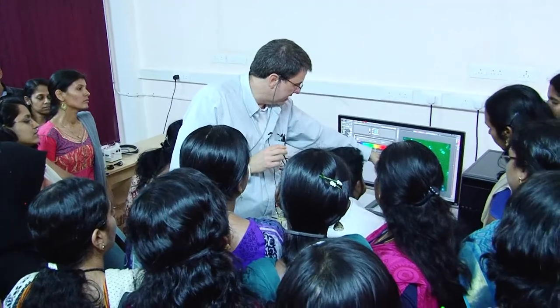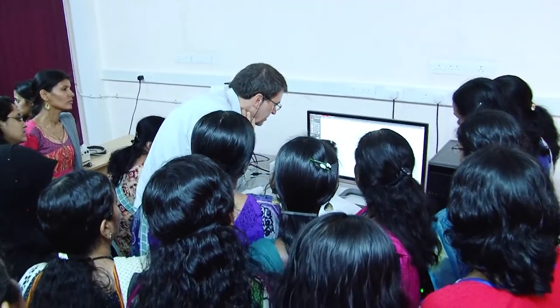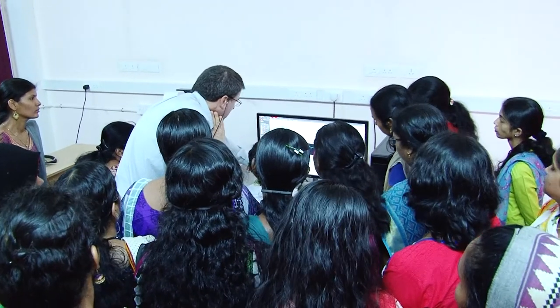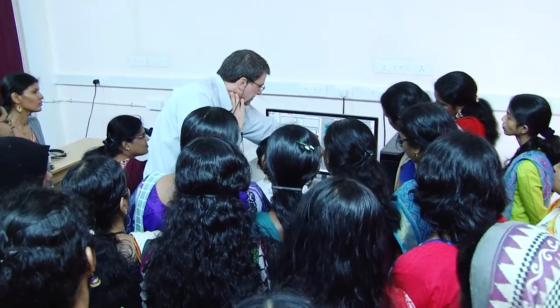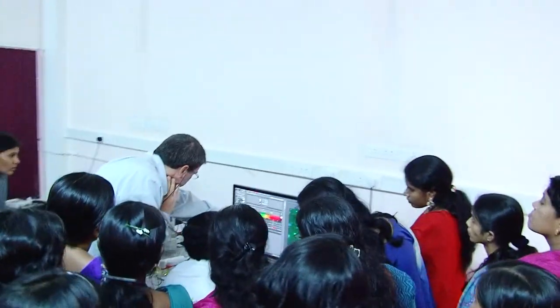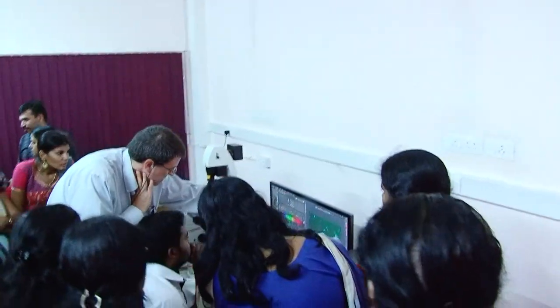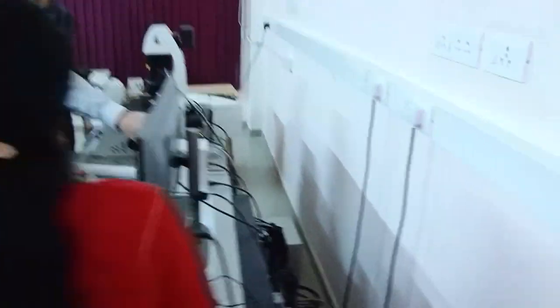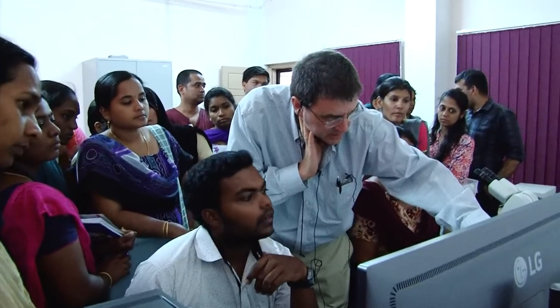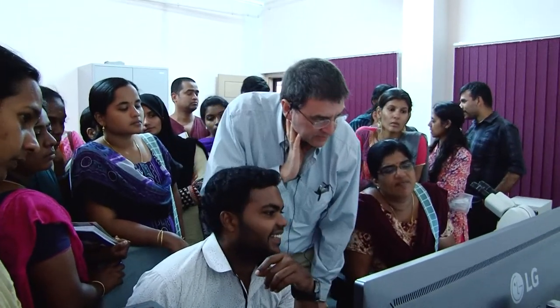Okay, so look at the quality of this as it goes. Is it done? Yeah. Okay, so go back to where we were. Okay, so look at the quality, right? Now let's see if averaging helps. Okay, so let's run the exact same stack, but let's run a frame average, not accumulate, but average, like this one here. Yeah, run that at 4.